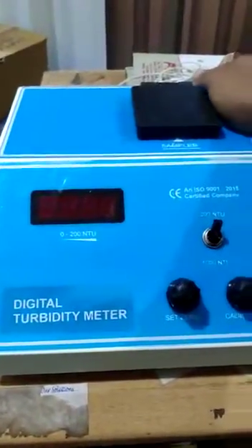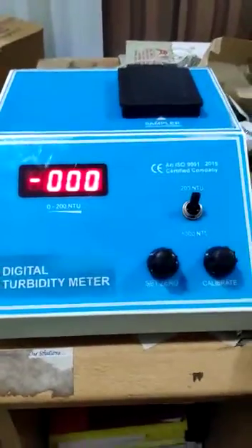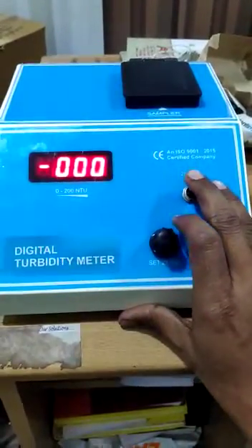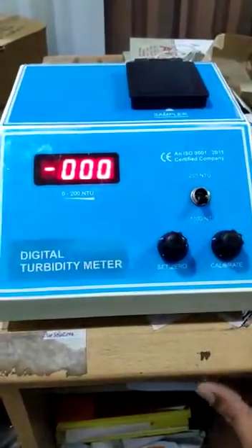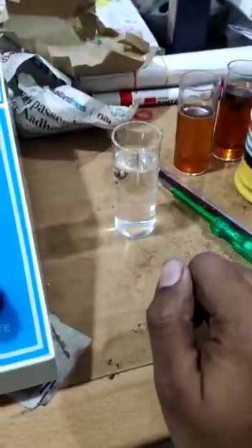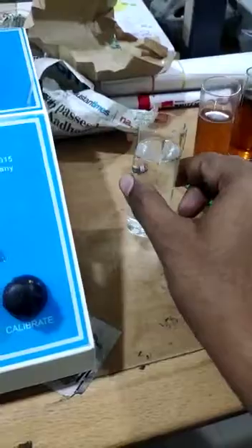Switch on the machine. Put blank water — this one.